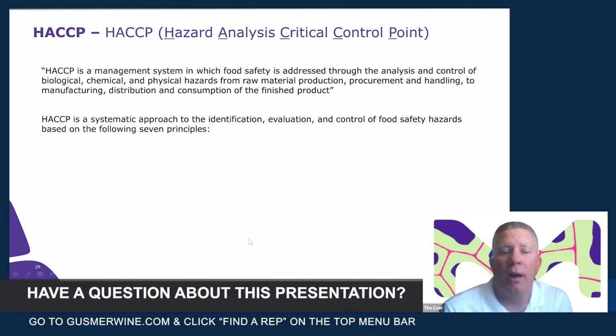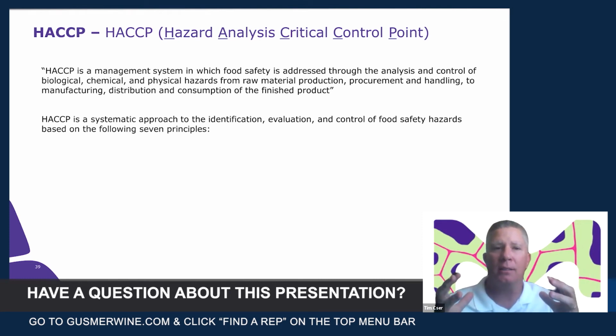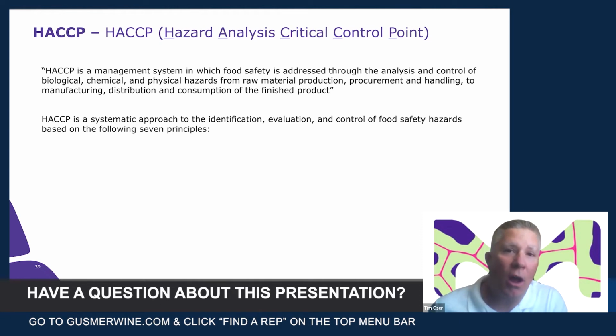How do we choose where to look with our hygiene testing? We have a HACCP plan. HACCP is Hazard Analysis Critical Control Point. What you're doing when you're looking at a HACCP plan is essentially looking at your entire process and determining, like Calvin was talking about, if I have a point that's over top of a drain, that might be a critical control point.